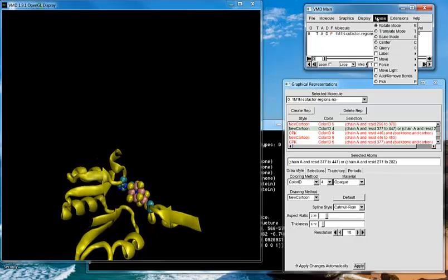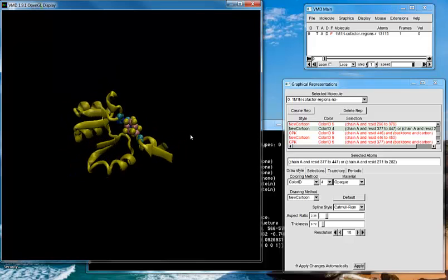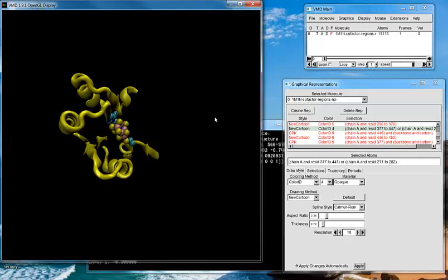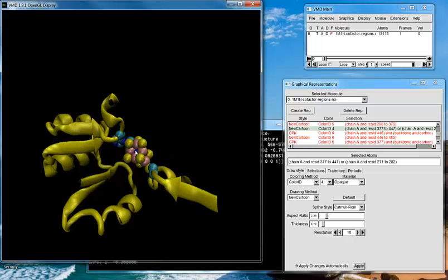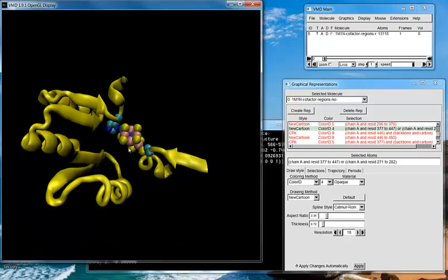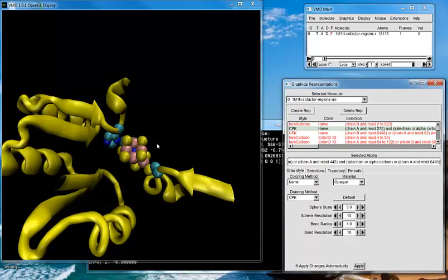And so I click on my mouse, center down here. I can translate this, rotate around. So now I can look at really what residues are surrounding that. This piece is a little bit harder. This takes a while to get used to. If I go in here and click on the CPK version, which is this component that I'm showing here, again, I can pull that off or put that back in again.